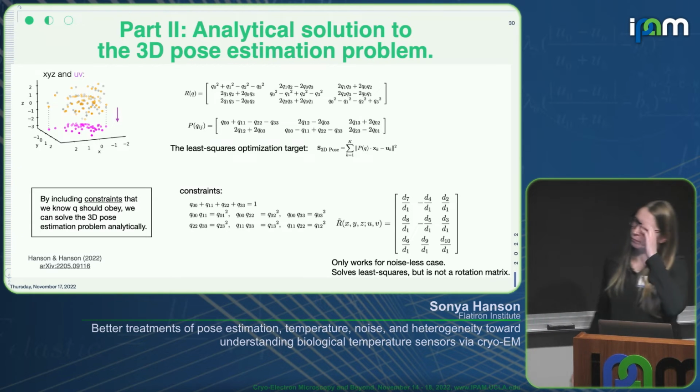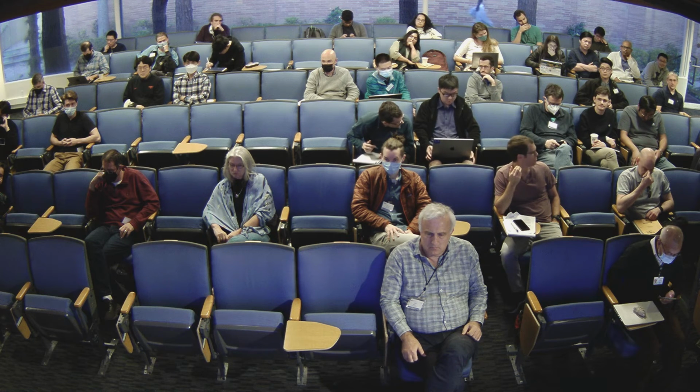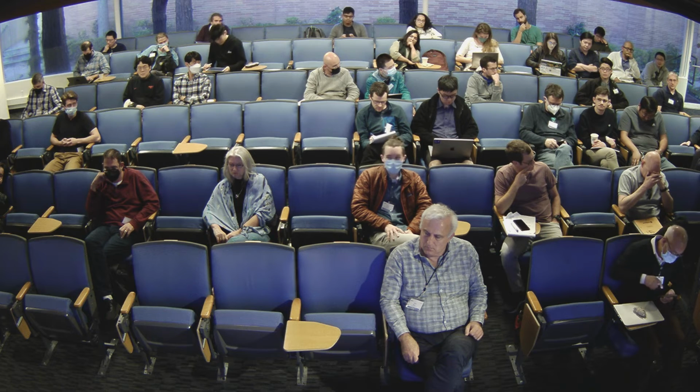You know this related problem where you have several such projections and you do not know the 3D structure and not the pose. In computer vision this is called structure from motion. Basically people will say we can know which point is which in different projections, but we do not know what the 3D structure is and we do not know what exactly the projection dimensions are.